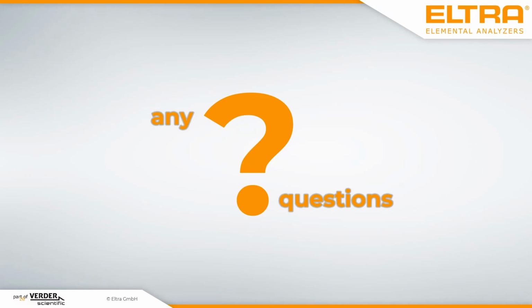The other thing colleagues asked about is the tip for the graphite crucible. It's a tradition, more or less, to make it from graphite in the ELTRA ONH-p2, and we have used it for many, many years. On the one hand, it wears a little bit more.